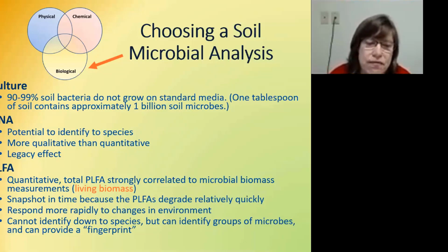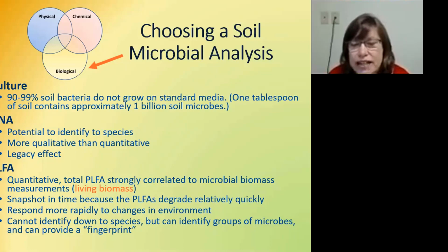So with PLFA, it's quantitative. The total PLFA is very highly correlated to microbial biomass measurements. And this is also the living biomass because phospholipid fatty acids degrade rather quickly. So you're getting a snapshot in time of the microbes that are presumably living. And because of this, you can see rapid changes in the environment.